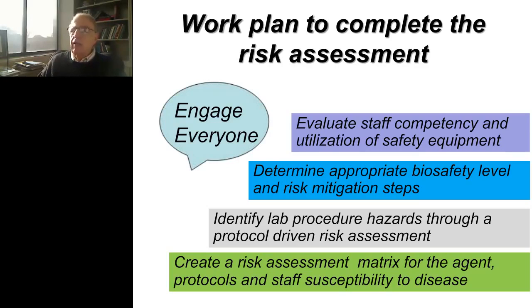This is one area that's a good example that you can have a competency written on. Another competency may be utilization of a biosafety cabinet. The CDC recently put out through their TRAIN system a really good training video on using a biosafety cabinet. Reviewing that video could be part of a staff member's annual competency so that they are proficient at using a biosafety cabinet.